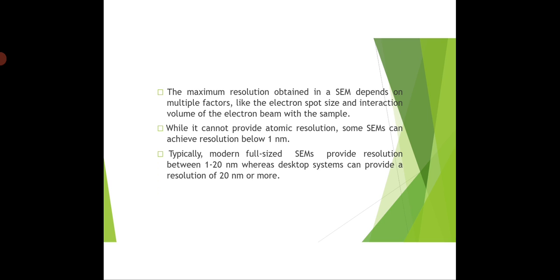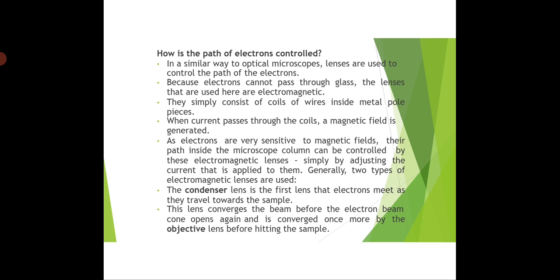While it cannot provide atomic resolution, some SEM can achieve resolution below 1 nanometer. Typically, modern full-size SEMs provide resolution between 1 to 20 nanometers, whereas desktop systems can provide a resolution of 20 nanometers or more.